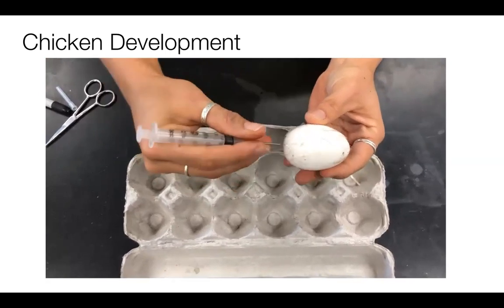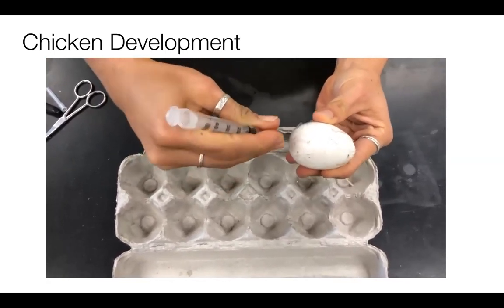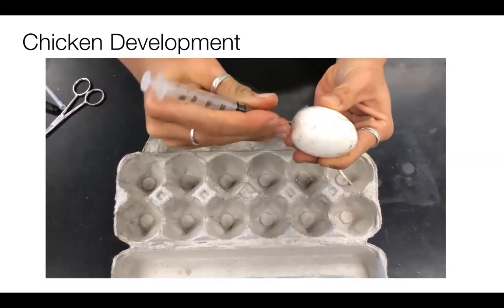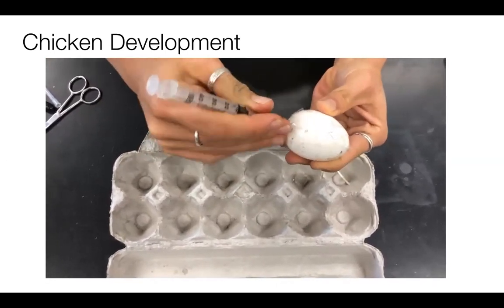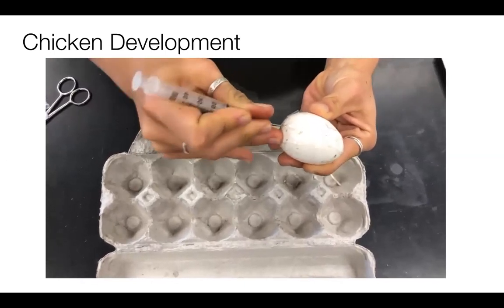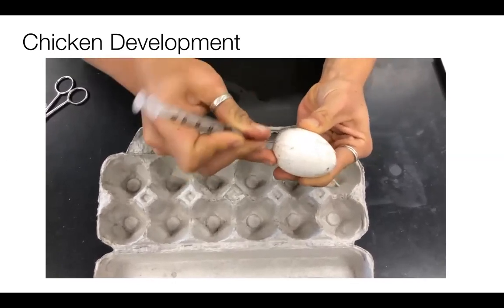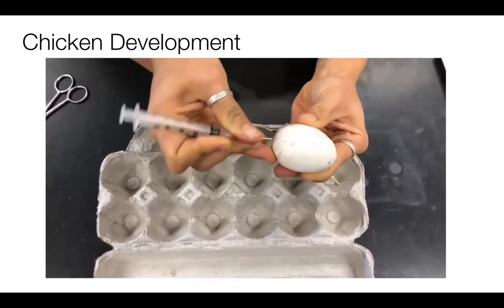The way I like to do it is I'll put a little bit of pressure and twist it around in that diagonal fashion. Once you puncture the egg, the needle will go down instead of horizontally into the egg. Sometimes it takes a little pressure.